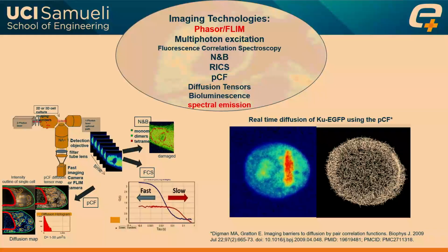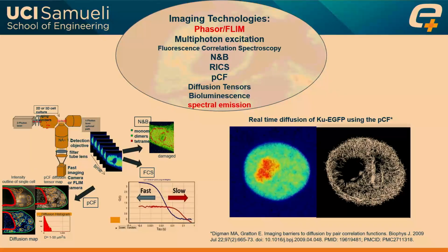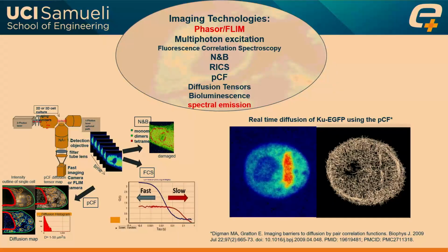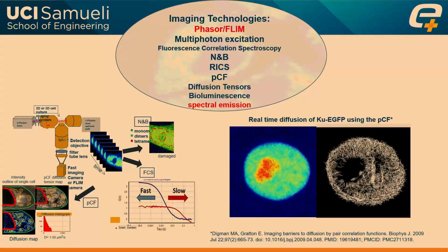I'm just highlighting a few imaging technologies. As mentioned, I was a postdoc with Enrico Gratton, who spearheaded the Laboratory for Fluorescence Dynamics. Over the years, we co-developed many of these techniques that I'm highlighting here. Today I'm going to talk about the phasor FLIM analysis.